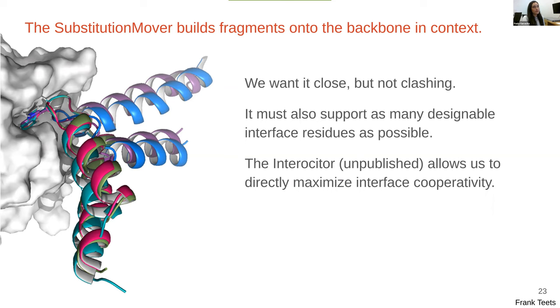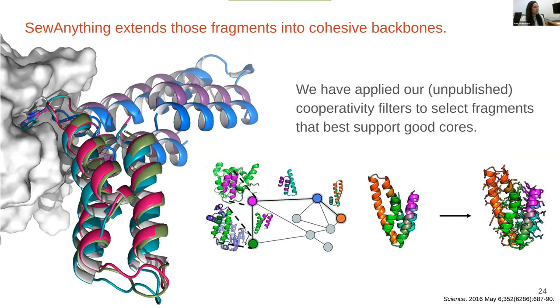The next step in the design process is, once we have that two helix loop helix fragment, we can then use it to create a helical bundle. Initially, I did try to do more than three helical bundles. I went up to six helical bundles and used Rosetta, again, with all these metrics to evaluate what was the best design strategy. Overall, the three helix bundles seemed to make the best interface and just be more favorable compared to going to four helix or five helix bundles.